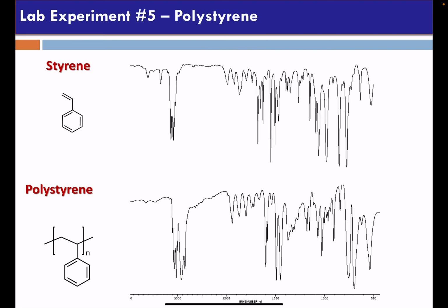So in lab number 5 specifically, what we can consider is using the IR to speak to the purity of the material. So recall that styrene became polystyrene through our nitroxide-mediated radical polymerization, and there is the opportunity for an impure sample to be isolated. So if polystyrene were contaminated with leftover monomer, as you know, your conversion values may not be 100% from your earlier data, there's the opportunity for styrene to contaminate and contribute signal in the ultimate spectrum.